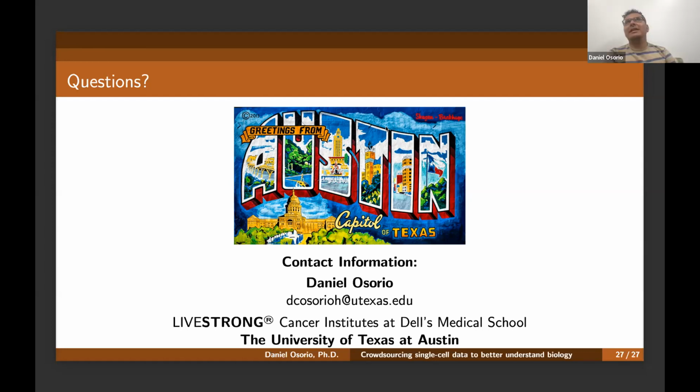People have always been reporting that the new version of the 10x system, for example version 3, produces more mitochondrial reads than version 2. And some of them associate it with the protocol having a step where the cells are in the cool bath for about 10 minutes. This changed the protocol compared with version 2.